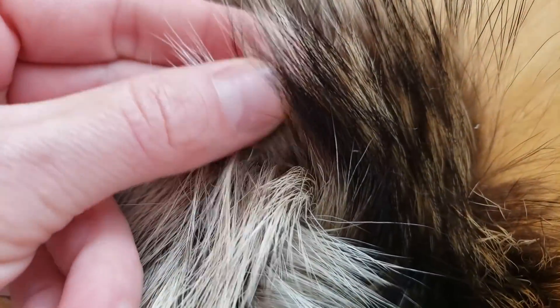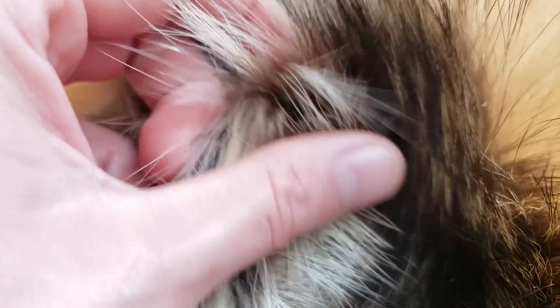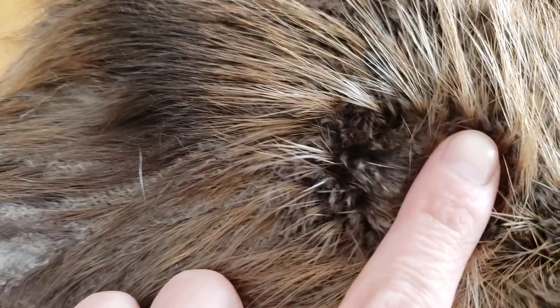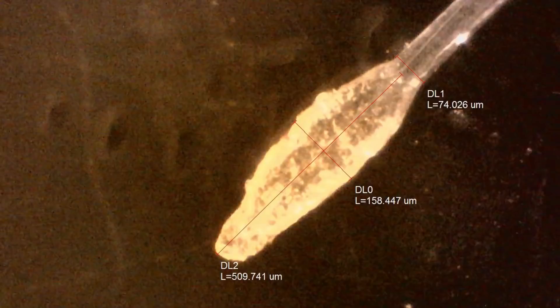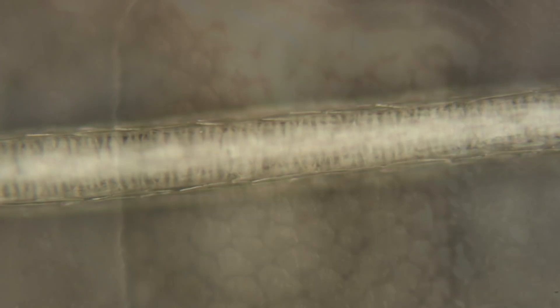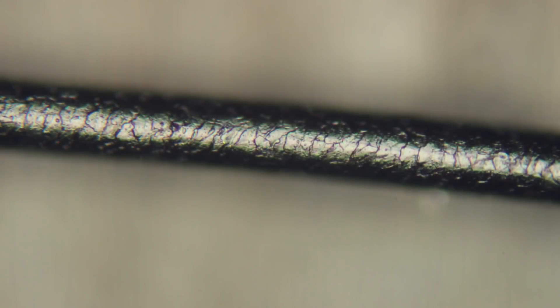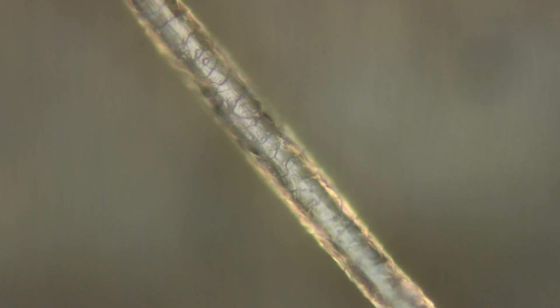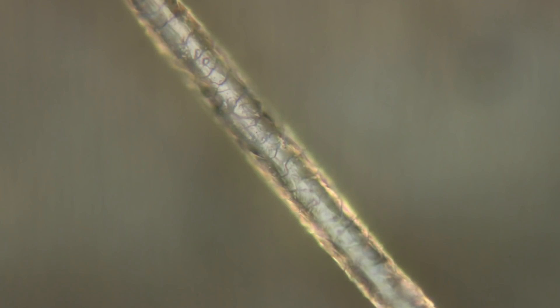To identify particular hair using wildlife forensic techniques, there's a lot of information that goes into the final determination. Looking at the hair, you can tell a lot from its size — length, width, and color — what the root looks like, what the scale pattern is, and what the medulla looks like. There are lots of books and online resources that give you the specifics for each different species.